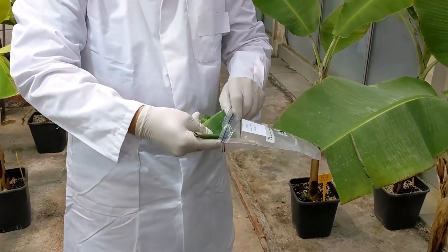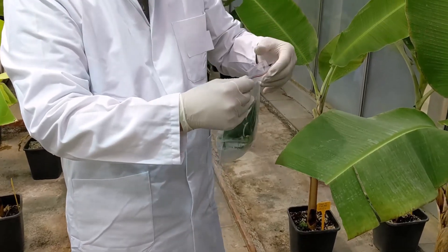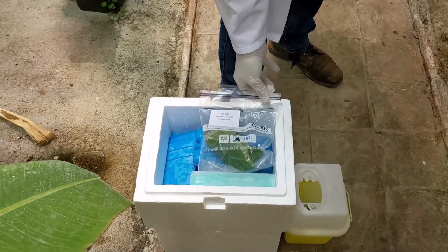Between each sample, scalpels and gloves are changed to avoid cross-contamination between plants. After collecting all the samples, they are moved to the laboratory for further processing.